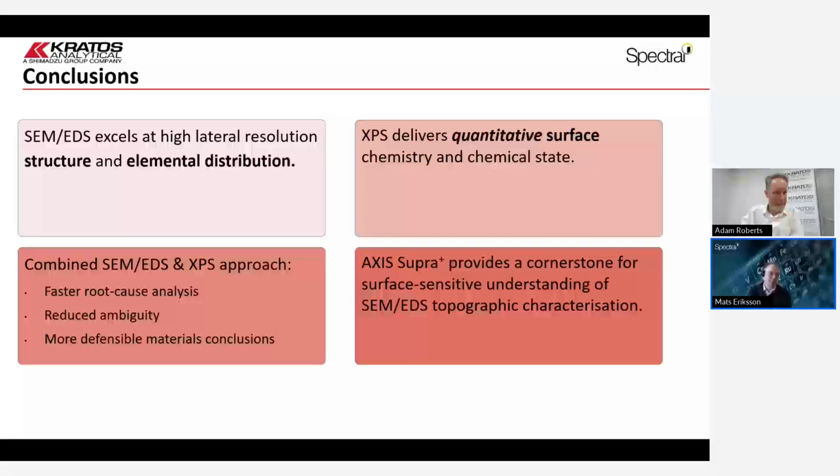Yes, I think a particle which is a micron big is too small to be imaged by XPS, but it still will react like a bulk material when it comes to the analysis, I presume.